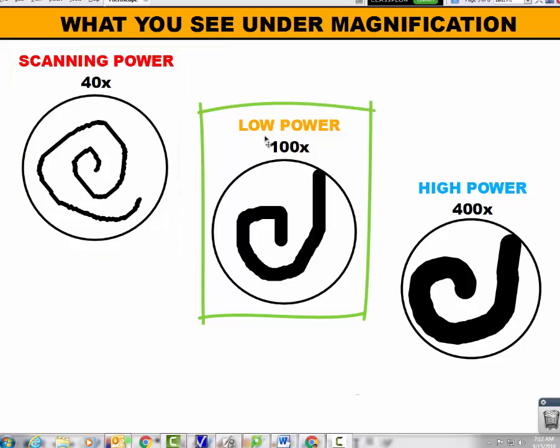Low power is going to raise it to 100 magnification. So we're going to zoom in and it's going to make the object look bigger. We're going to be able to see a little bit more detail but less of the total object. Here you have this entire shape whereas in 100 power you have just this part of the shape.